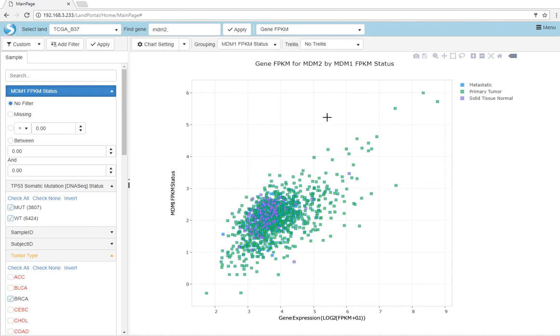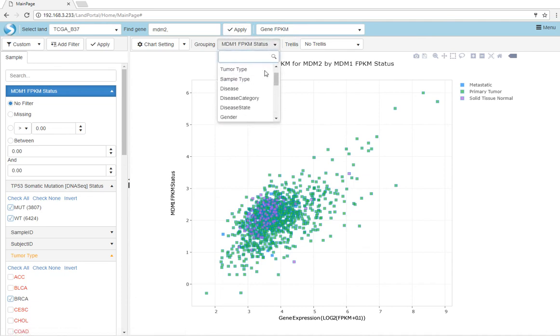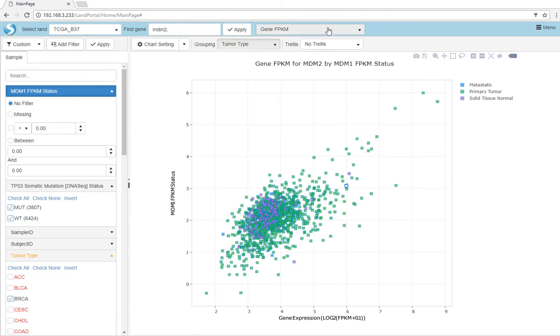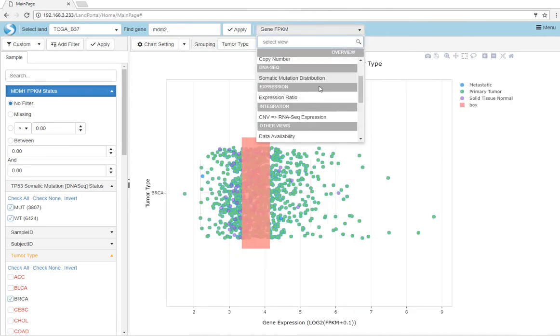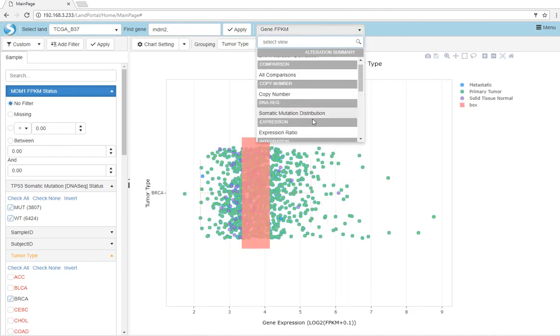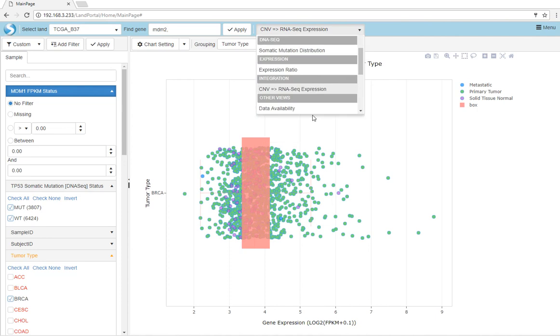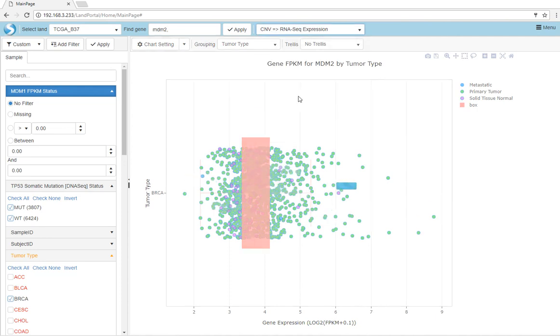In addition to the gene FPKM view, there are additional views for gene level. Let's group back by tumor type and look at CNV to RNA-seq expression integration.